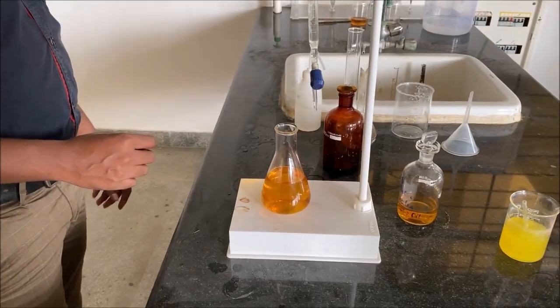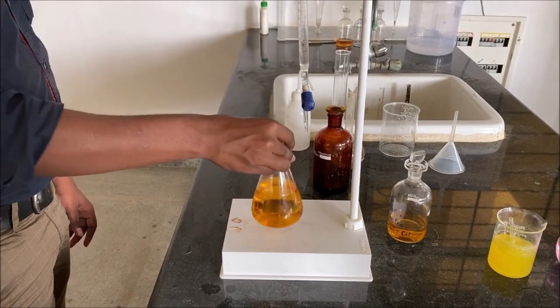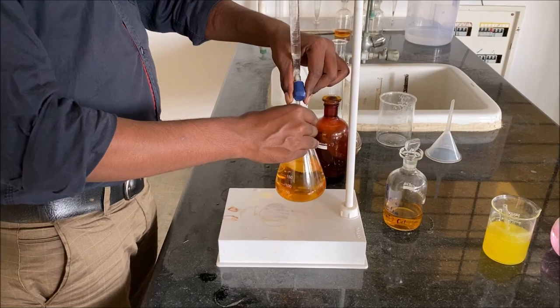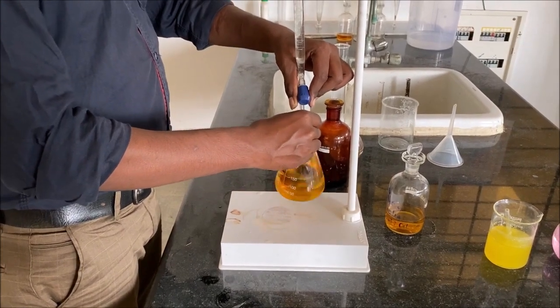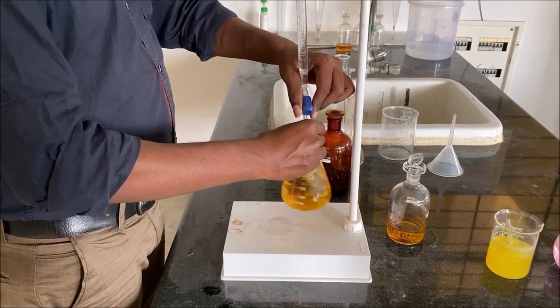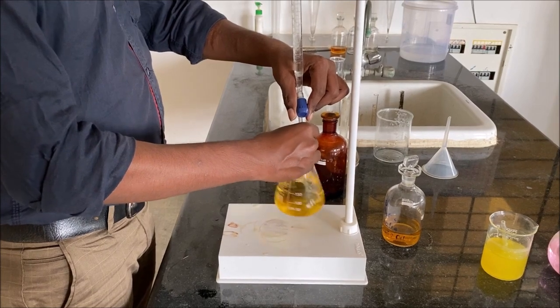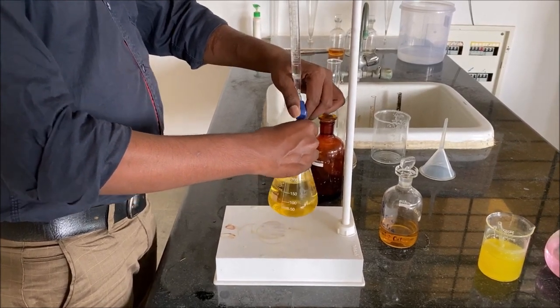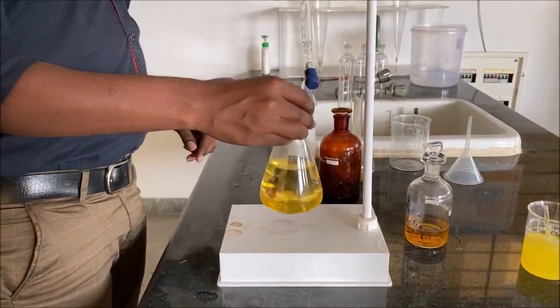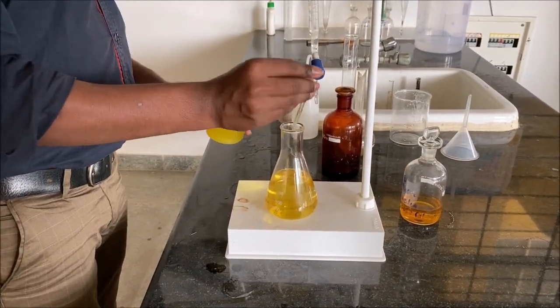The 203 ml of transferred solution in the conical flask is titrated against standard sodium thiosulfate solution until the color turns pale yellow. Now we can see the solution turning pale yellow. At this stage, we are adding a few drops of starch solution.